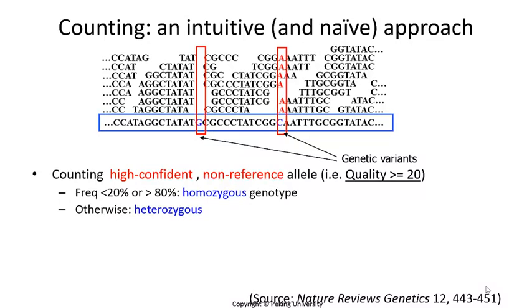This rule of thumb in fact performs very well at loci that are deeply sequenced. However, the performance is poor at heterozygous loci and loci that are not deeply sequenced. Also, this naive method strongly depends on parameters, for example, the 20% and 80% mentioned before, chosen subjectively.